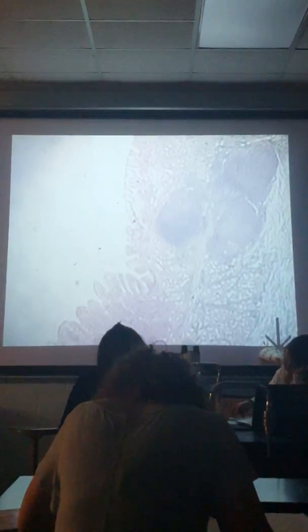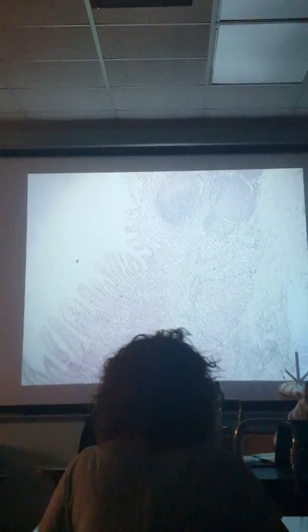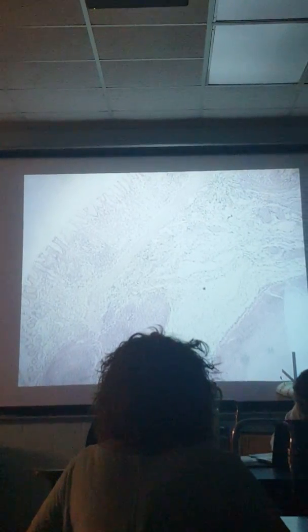Now we're going to go from stomach to small intestine, or more specifically, stomach to duodenum. Some say duodenum, I've heard both. Here we have, remember, those gastric pits. They're not as developed. We have all those layers: the mucosa layer, submucosa, and the muscle layer.